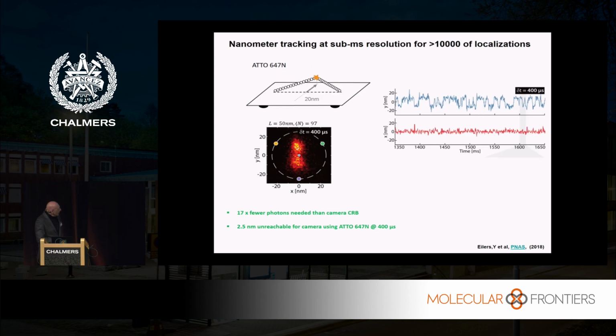And this is just the traces, for the experts among you, to show you that this movement is clearly vindicated. And this is now not just a random cartoon. This is the actual movement of that molecule in this focal plane. So it really moves like this. The reason why I'm showing this is that one can now imagine experiments at a very high speed. So you label something like a protein, and the protein starts to fold or something.